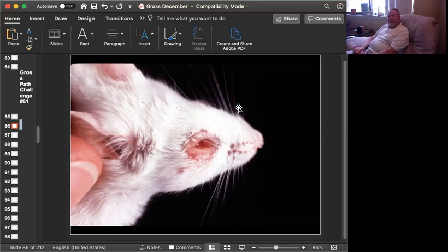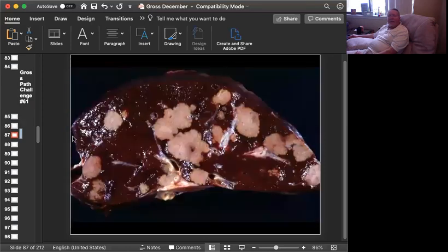And one other thing to mention about blepharitis, it's even more common in nude mice. And it makes a lot of sense because nude mice don't have any hair and they don't have any eyelashes. And eyelashes serve to keep stuff out of your eyes. And if you don't have eyelashes, you're going to be more prone to eyelid and eye orbital infections. So, BALB/cs, Pasteurella pneumotropica, ulcerative blepharitis. Let's move on to slide 3.